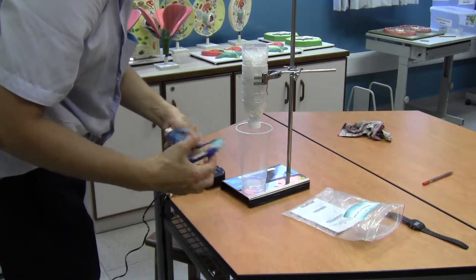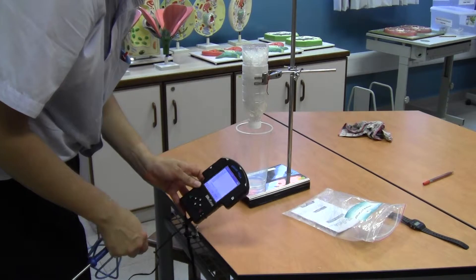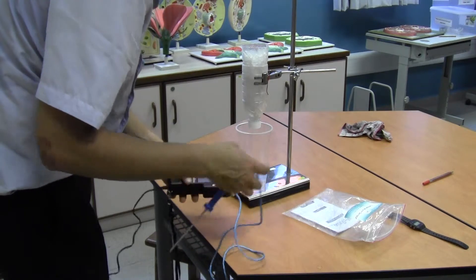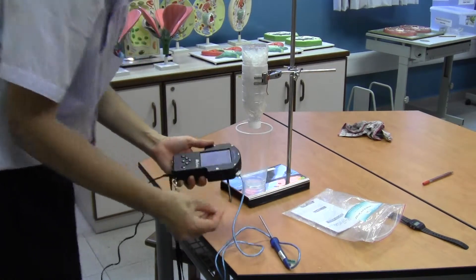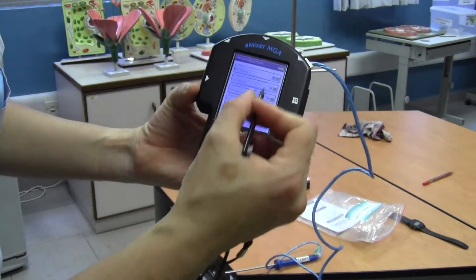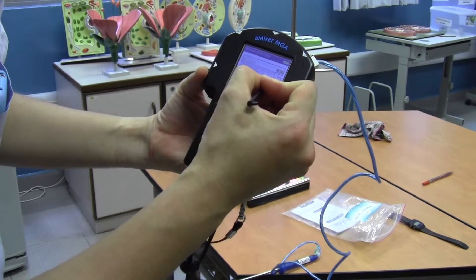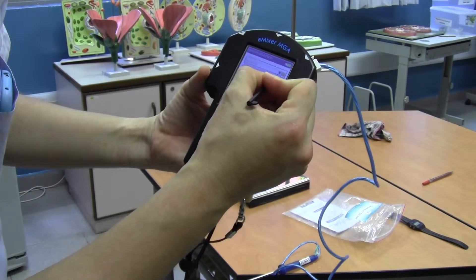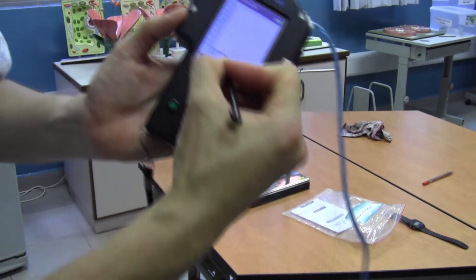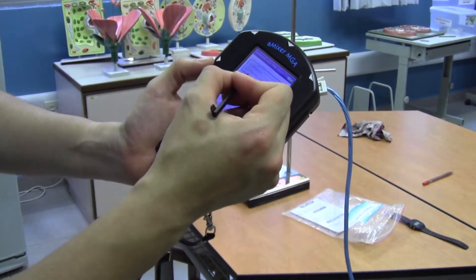Now we take out our temperature sensor. Turn on our data logger with the switch over here — and it's on. Plug our temperature sensor into channel number one. Then we select the sensor type, change it from no sensor — it should be auto-detecting but it's not, so I have to manually set it. We set it to temperature sensor, channel one, temperature minus 10 to 110. Then we click on the clock icon and set the sampling rate to 10 samples a second.